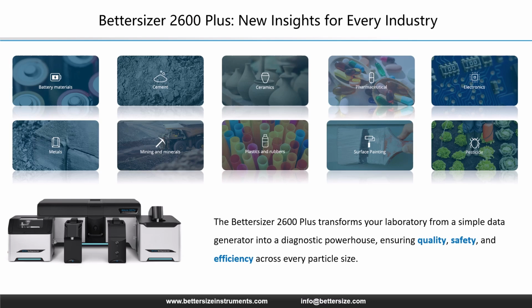We are moving beyond simple particle size to process intelligence. In batteries, we move from measuring average size to ensuring safety. By detecting a single large agglomerate that causes a short circuit, we protect the battery's integrity. In pharmaceuticals, we move from volume distribution to predicting bioavailability. By precisely measuring the fine fractions that drive dissolution rates and detecting the unwanted agglomerates that ruin content uniformity, we guarantee consistent drug delivery.